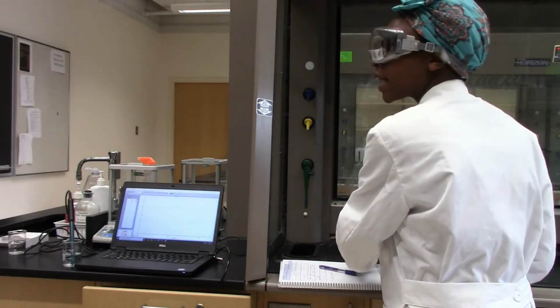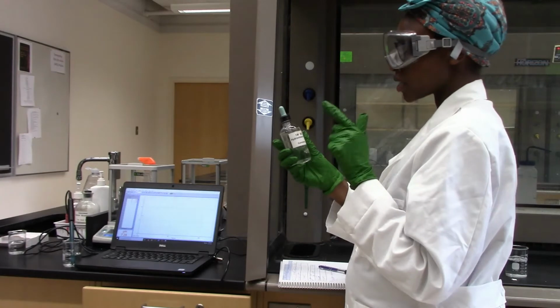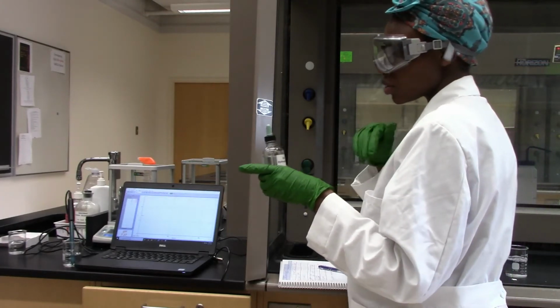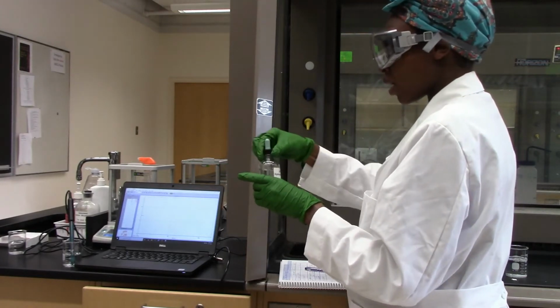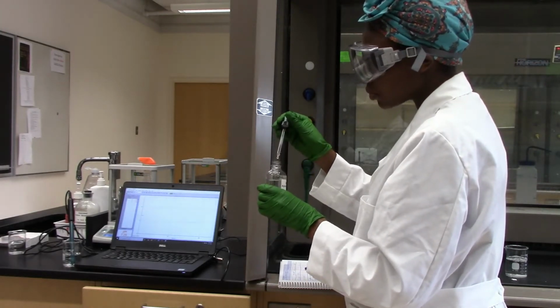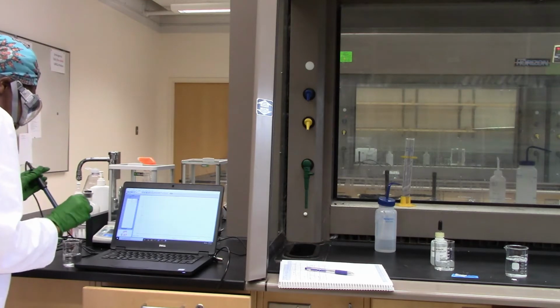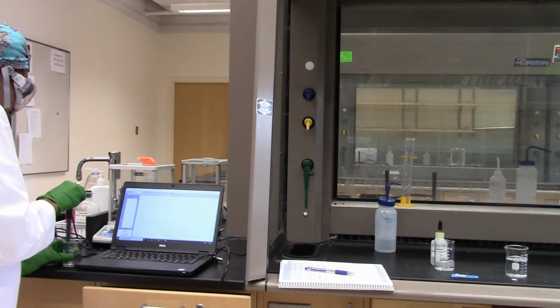Now I'm going to add different amounts of 1 molar HCl, and then I'll also add different amounts of sodium hydroxide, which is our base. So just looking at the 1 molar HCl, let's see how the pH readings will be. I'll start with a tiny drop, like just touching the water with the tip of the dropper, and see what it reads.